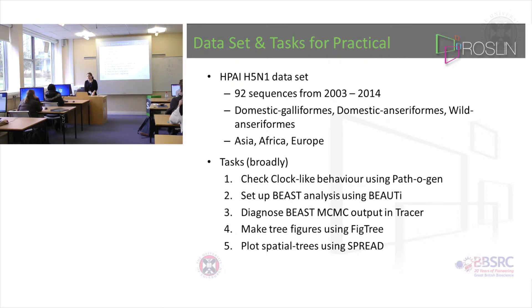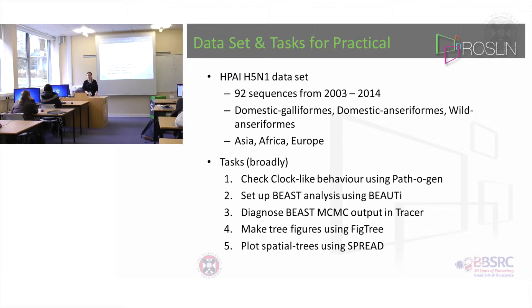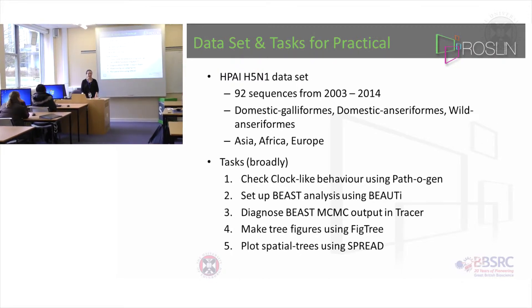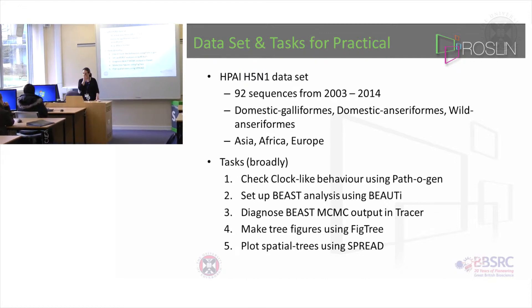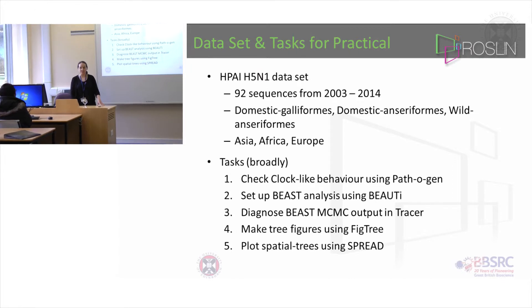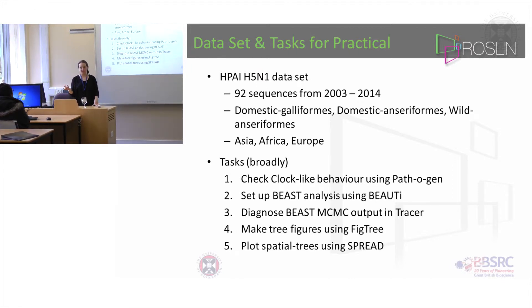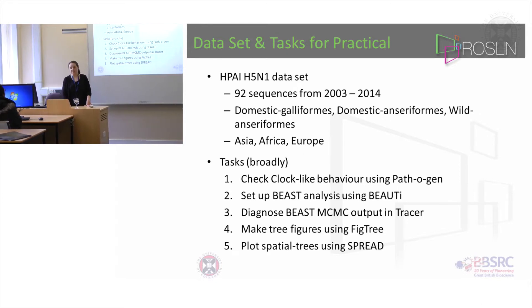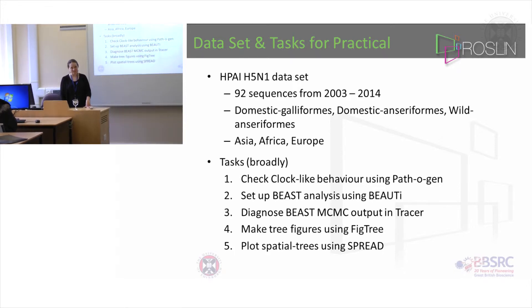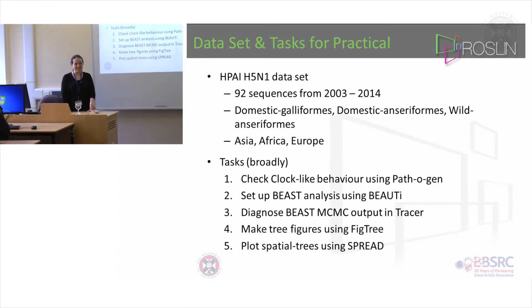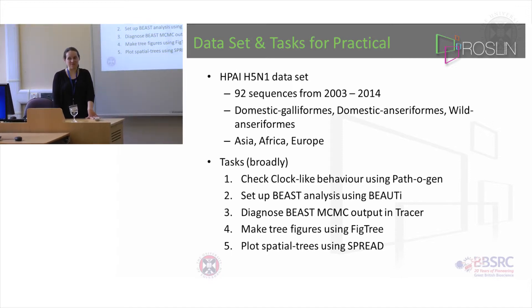What I'd like you to do is set up those XML files and start to run one instance of BEAST, but just start it going and then you can stop it. The reason for this is BEAST is a complex model — it's called BEAST for a reason — and it takes a long time to run. So I've actually run a whole load of models for you. This is a small dataset and 92 sequences is actually quite small, yet some of these models were already taking six hours to run. Just to let you know, in my work I generally deal with several hundred up to a thousand sequences, and I'm often running things for three weeks on a server.